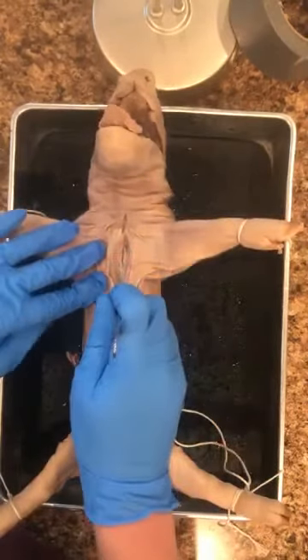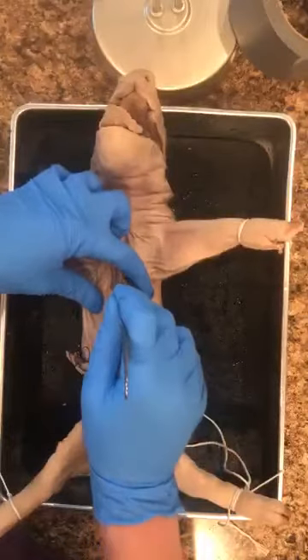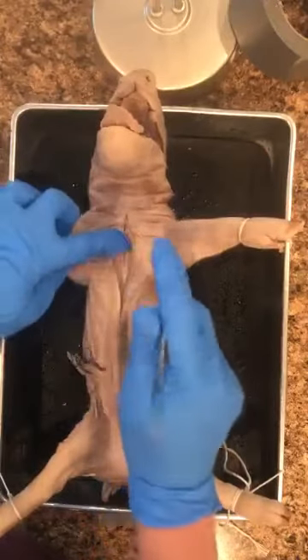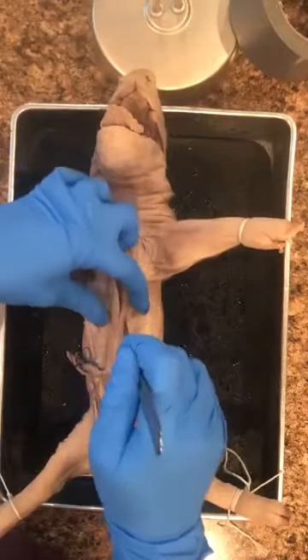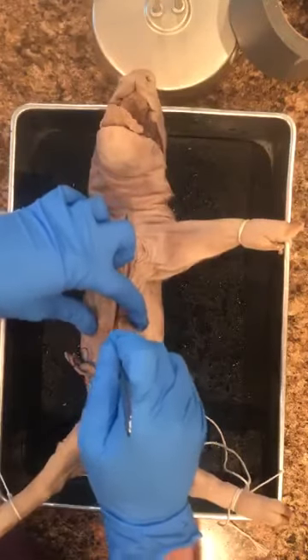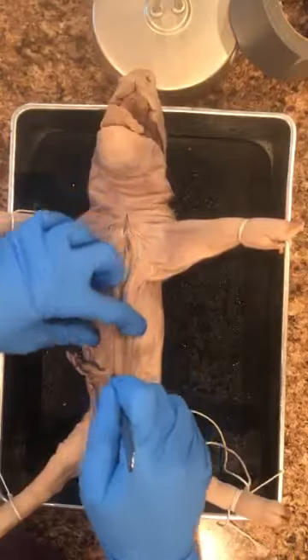Okay, you can see I'm going through the muscle layer at this point. Up here, I have to be able to cut through those, the ribs and the breastbone, or the sternum. Okay.